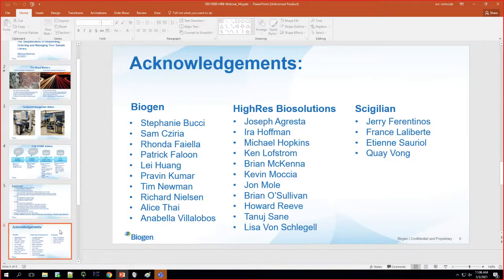It's actually very easy, and I would demonstrate it, but it's a very easy tool. You can select multiple wells and right click and assign a sample ordinal and a dilution factor to it. You can copy and paste. I would say it takes 2 or 3 minutes to set up a plate layout, maybe up to 5 for a 1536 plate, but it's pretty straightforward and it's not a big deal. We just try to limit the number of layouts we have for simplicity across the system, but from time to time I'll add a new layout. It just takes a couple minutes.